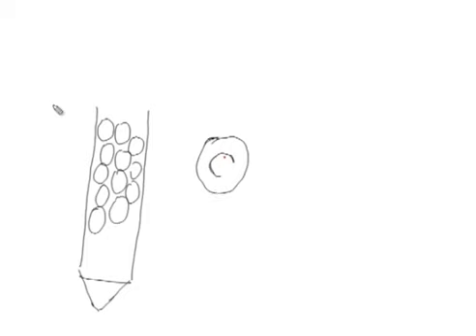To help you understand porosity, if this is the pore size, then what will happen? A molecule which is bigger than this pore size cannot enter here, but a molecule which is smaller than the pore size can enter into the pores. It can access the inner volume of this bead, which is the trapped solvent or trapped mobile phase, but the larger molecule cannot enter.